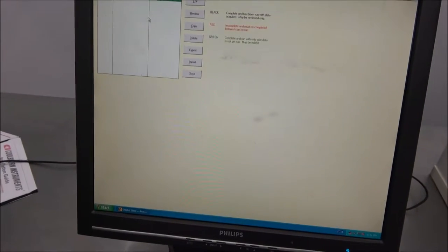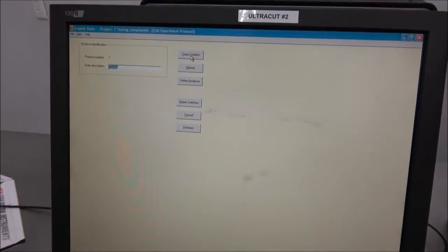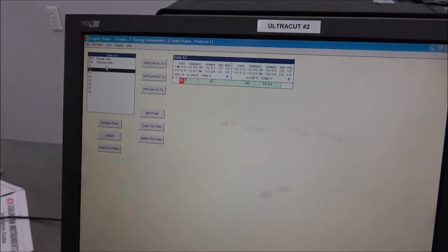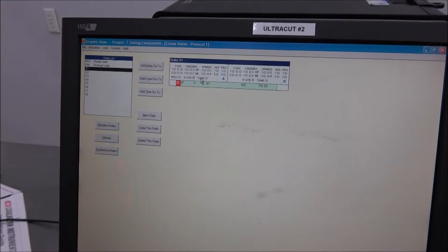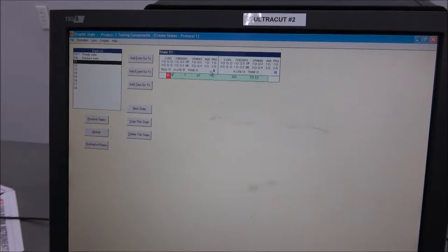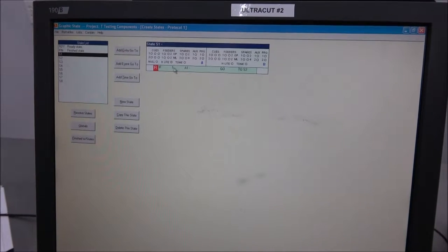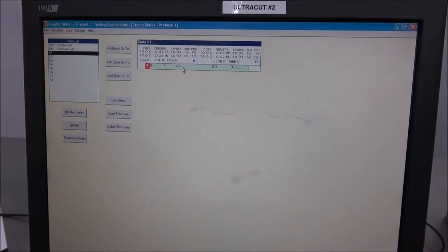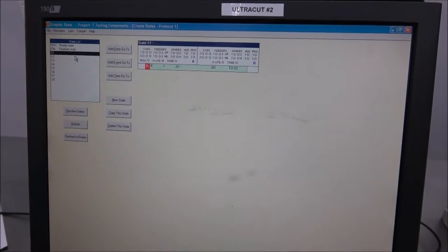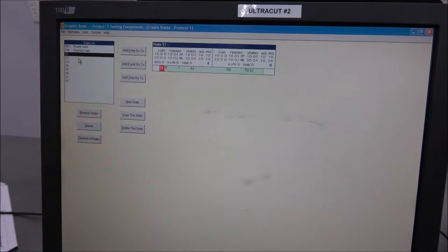So we like to show you the actual program that starts off. The home lights on at first, no particular reason for that. But at first you just hit the first switch, and then it'll take you to the second switch, takes you to three, and so on and so forth.